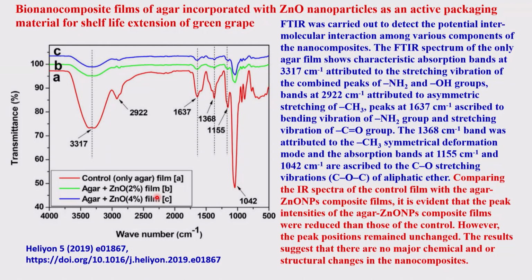By comparing the physical inspection of the grapes with the infrared spectrum of the film, you can talk about the durability, how long you can use it. To look at the durability, obviously you have to take the IR after wrapping and taking out for some days, for more days, etc. That is how you can extend the applications. Okay, so I hope that is also clear.